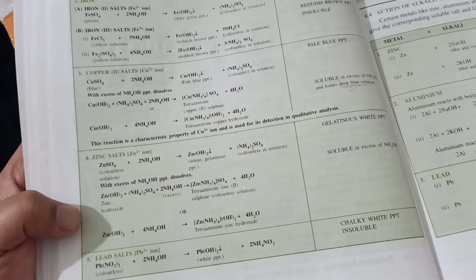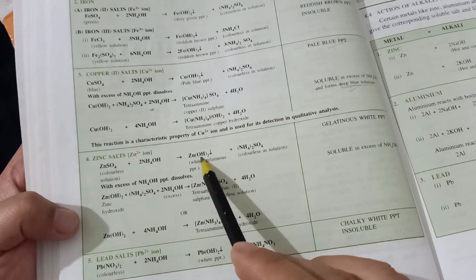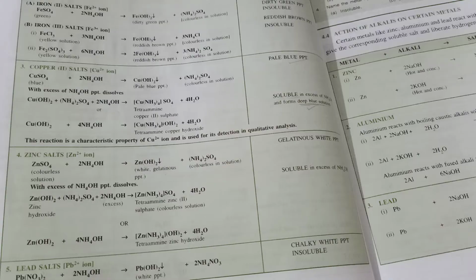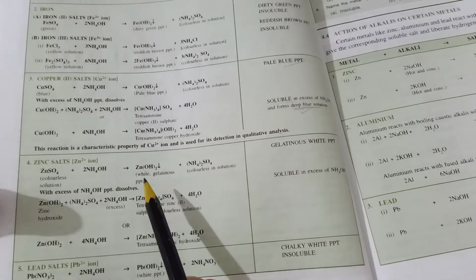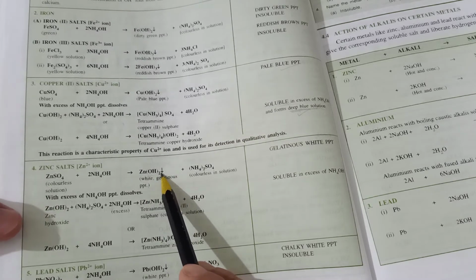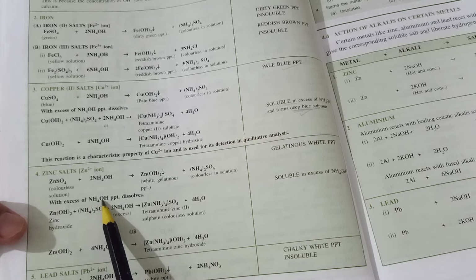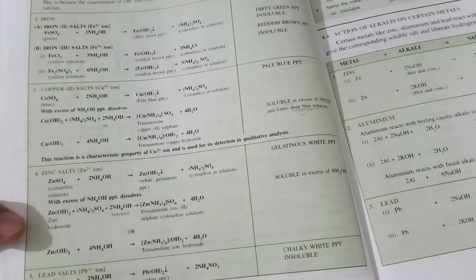Sodium hydroxide also forms a white gelatinous precipitate of zinc hydroxide, and this precipitate dissolves on treatment with excess ammonium hydroxide.